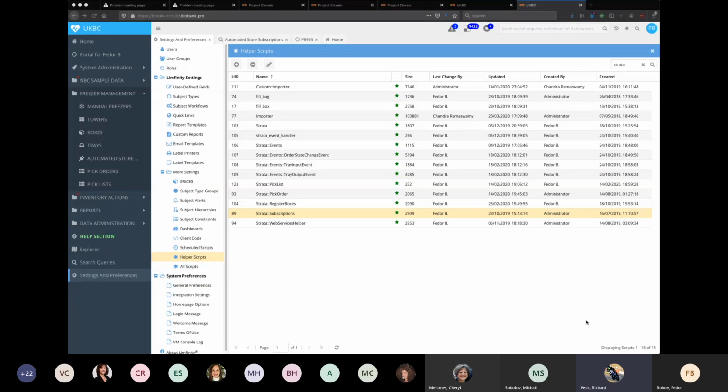Hi, this is Christopher. Just had a quick question. Is there any plan to put Limfinity inside the automated store? I don't think at this time we have any plans for that.